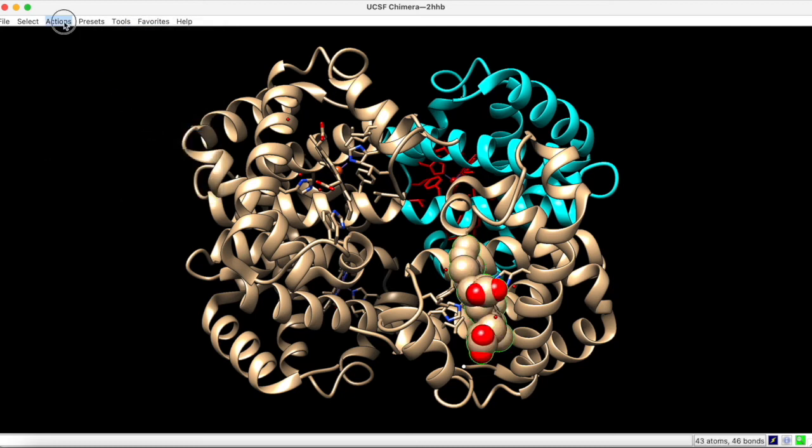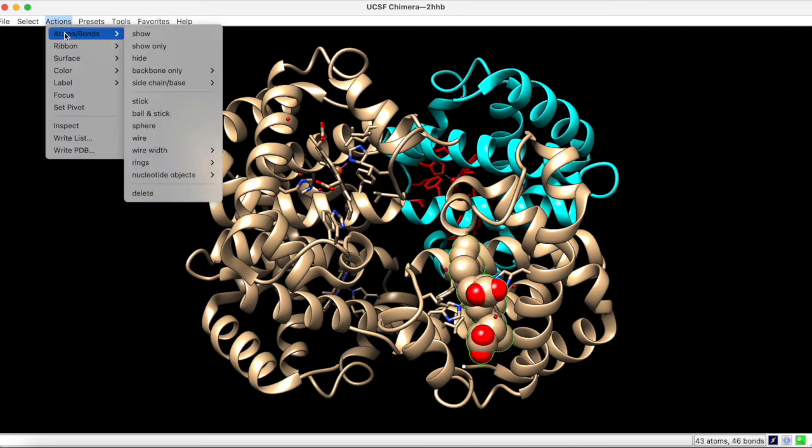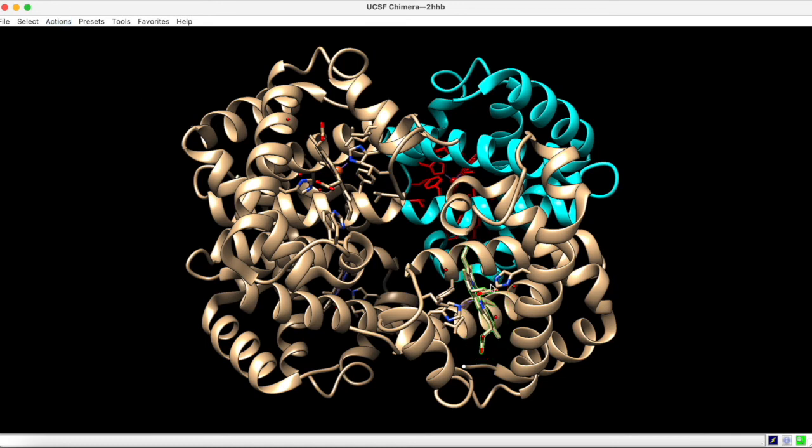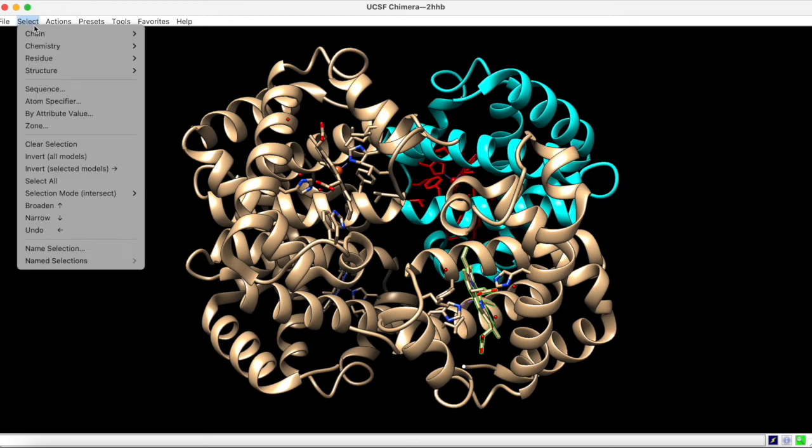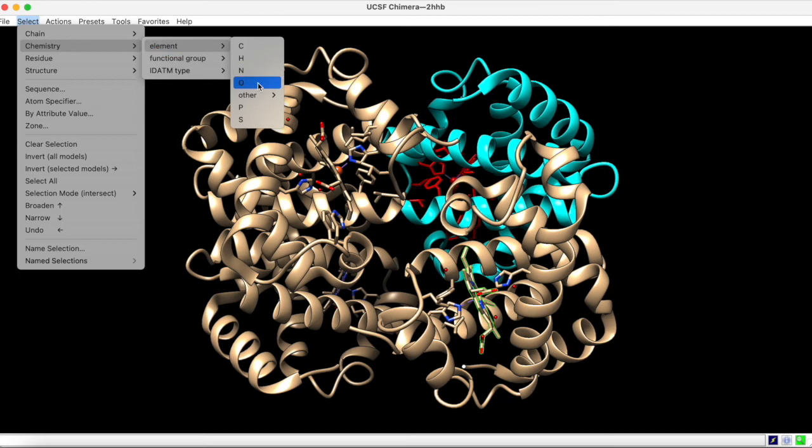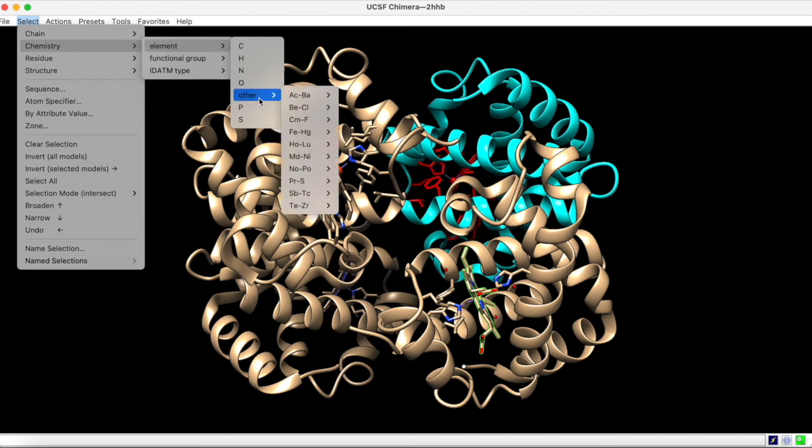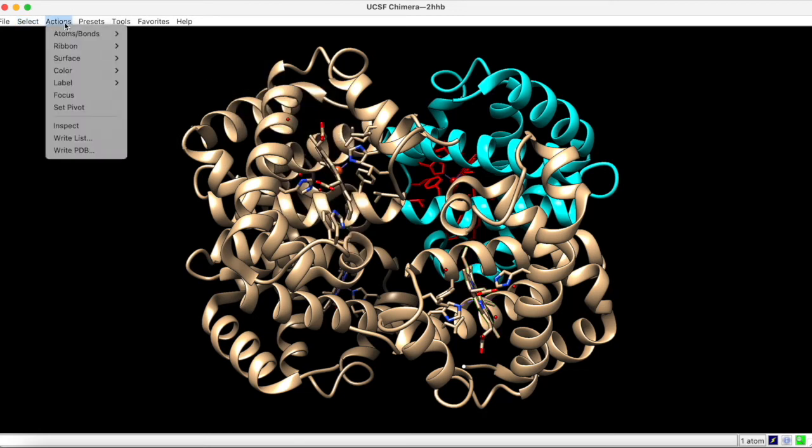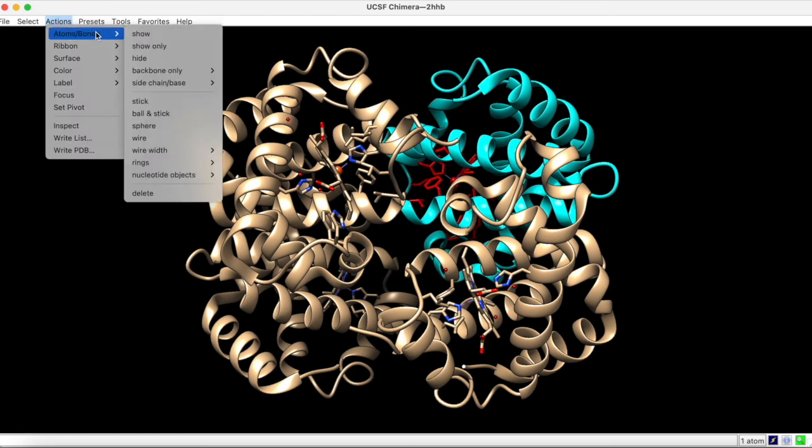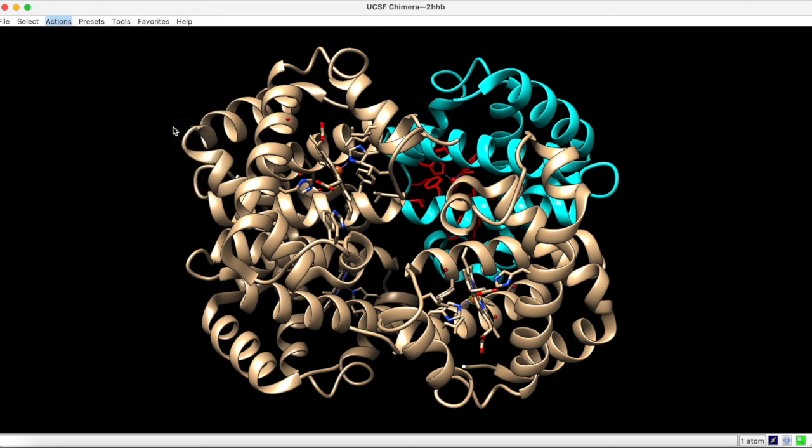Now, if you change the representation to stick, you'll notice that the heme group looks much as it did in the beginning, except the iron atom has sort of disappeared. However, remember that the selection mode is still on intersect, so under Chemistry, we can select the iron atom specifically. Now, under Actions, we can change the depiction of this atom to sphere, and the heme group is restored to its exact original representation.